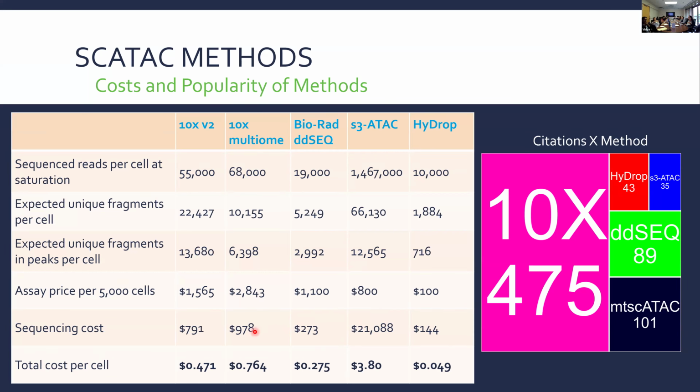Multi-ome is better. Yeah, and with the multi-ome, you get a little less from that side, but the advantage there is that you're also getting RNA-seq data, so you're getting transcript information from the exact same cell. So you can do independent single-cell RNA-seq and independent ATAC, and integrate that data if you're pulling from the same tissue type, but you're not getting truly, literally the exact same cell from each one. In this case, with multi-omic data, you are at a slight loss of information.